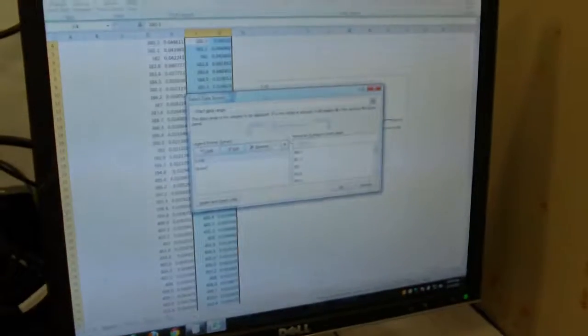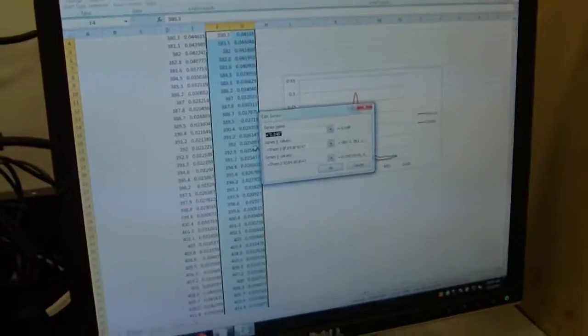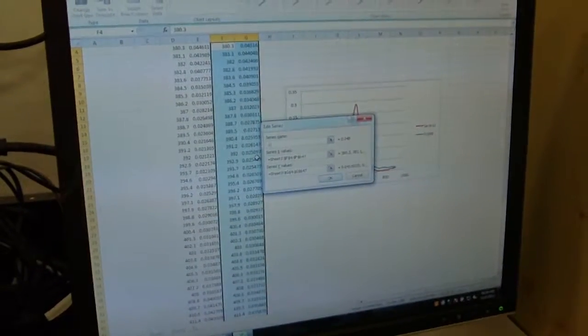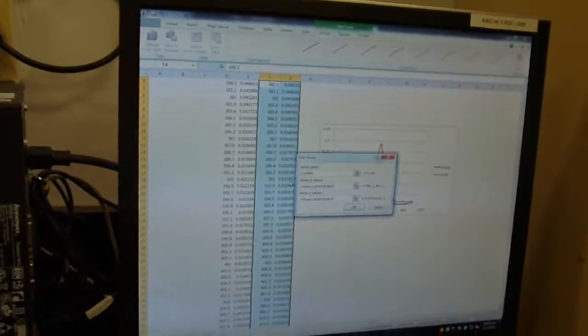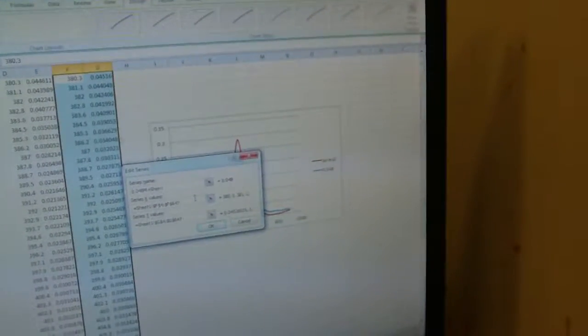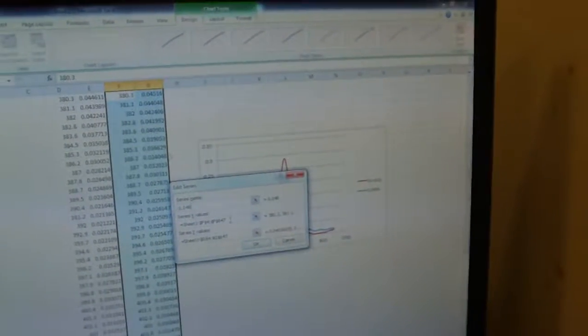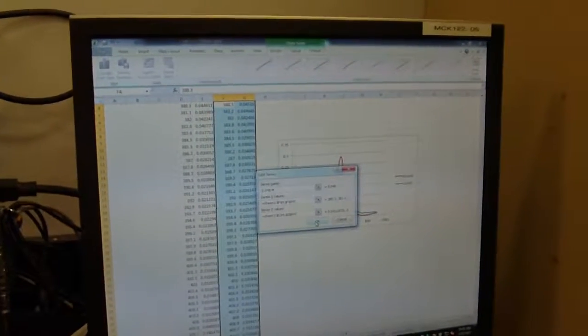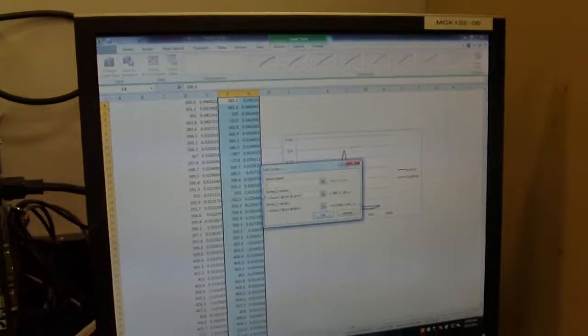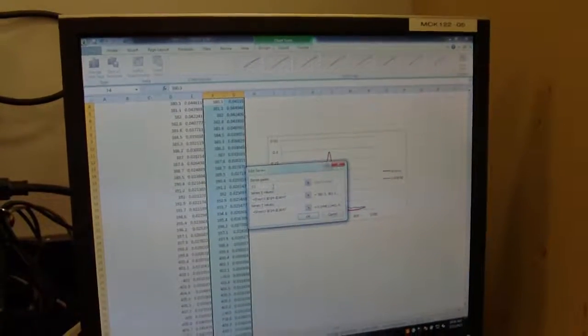Go ahead and go back in there and type 0.048 molar, right? Some of the Asian countries like to have that 0 in front of there. 0.0480. Oh, I hate that. Go back. Space M. There we go. Molar. Now we can push OK there, and we can change the second series, which is our 0.06 molar.